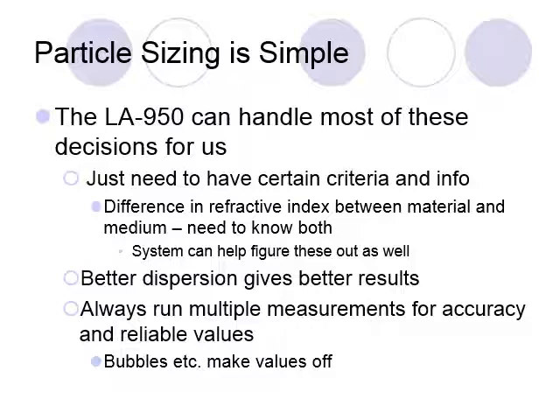The best thing for you to understand, and the biggest source of difficulty in particle size measurement, is the actual sample preparation and the choices you make to get a good sample for measuring particle size. The instrument is accurate, the instrument is reliable, it's usually very good at measuring things consistently. You can check standards, the behavior is very good. But you need to make sure that you have a stable dispersion of particles to get an accurate measurement. By dispersion, I mean both dry and wet.